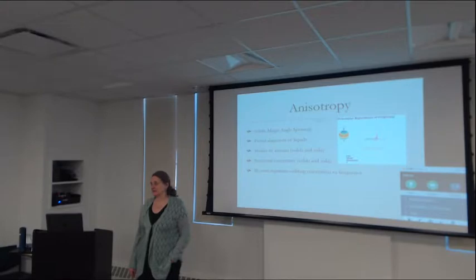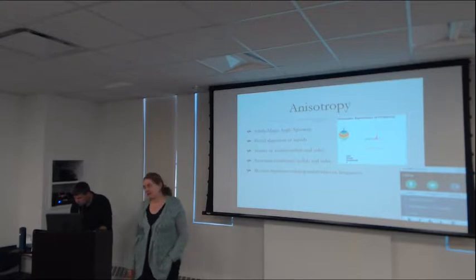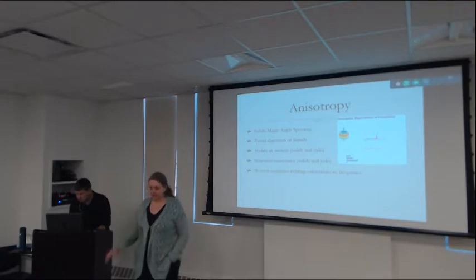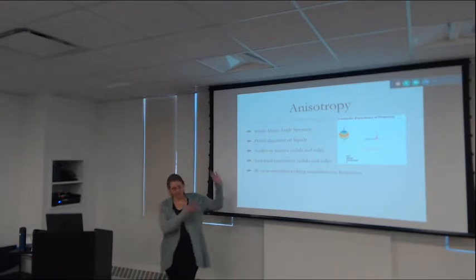And there are many things about that interaction, the dipole interaction, that we'll want to be able to treat quantitatively for both solids and solution. So these are some of the motivating considerations. What is it about NMR that means we want to deal with the equations for anisotropy? These are some of the experiments, okay?